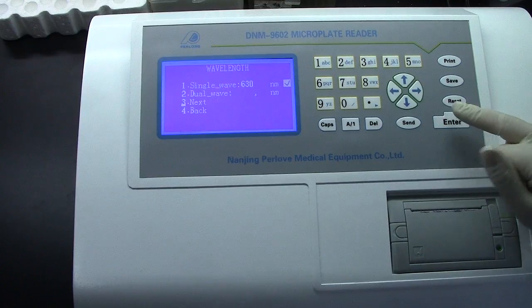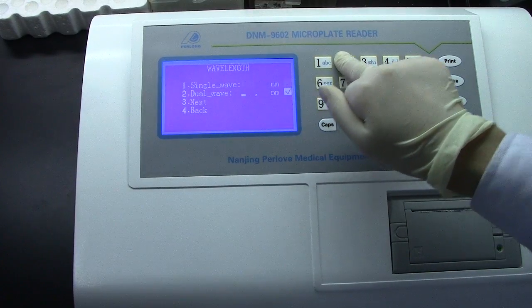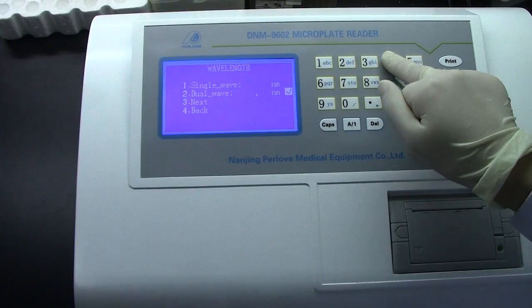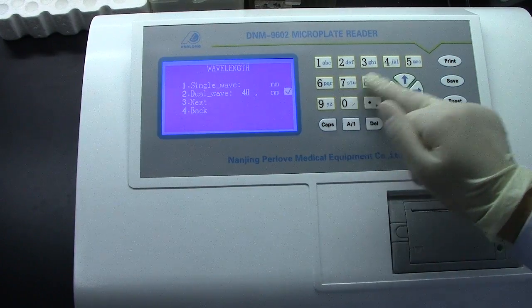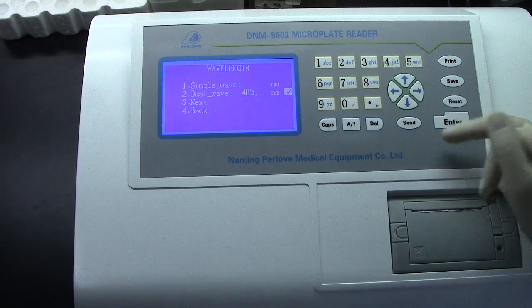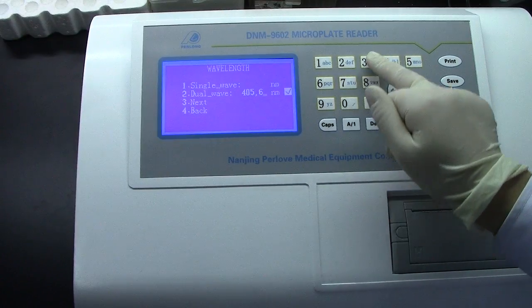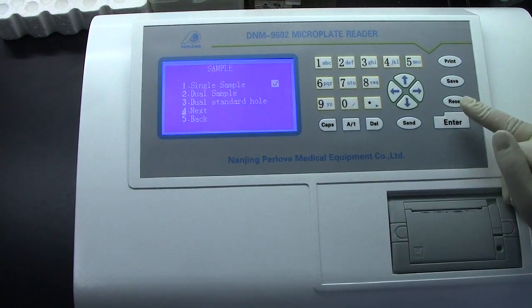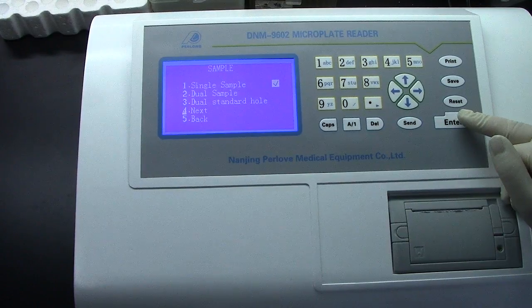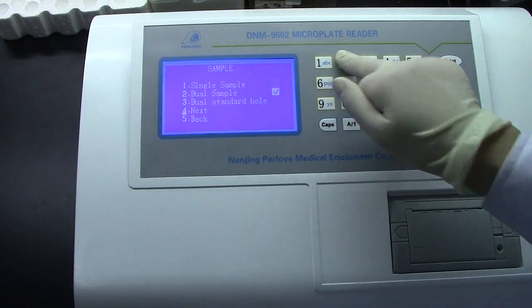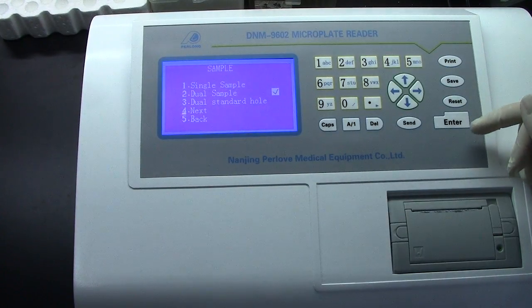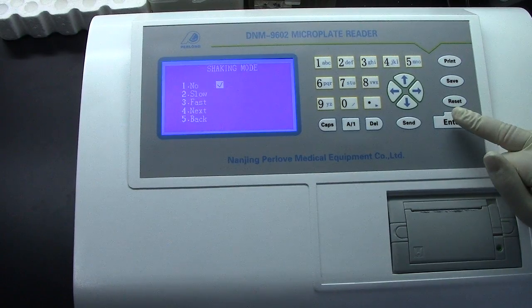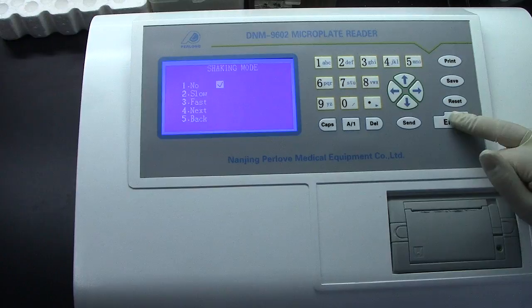This time we will choose dual wavelength. First, input 405. The second one is 630. OK. We choose dual sample. Last program we chose single sample. Press End to confirm. No Shake.